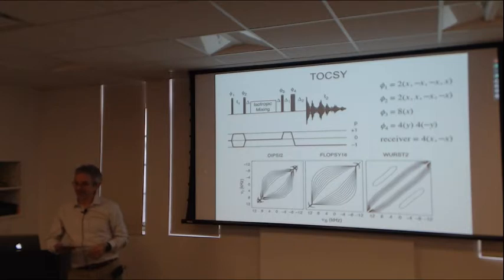Very hard to look at those kinds of sequences and understand what's going on. If you look at the DIPSI sequence, for example, the lengths of the individual pulses seem arbitrary, but you can see that they repeat in blocks. And if you look inside of an optimal control theory block, there's no apparent symmetry at all much of the time.